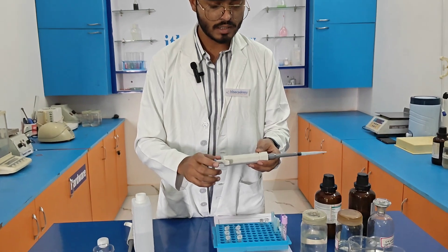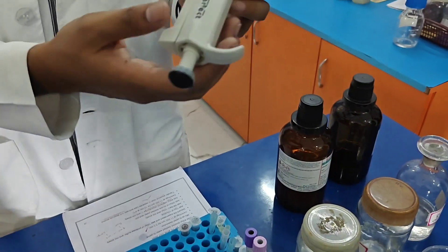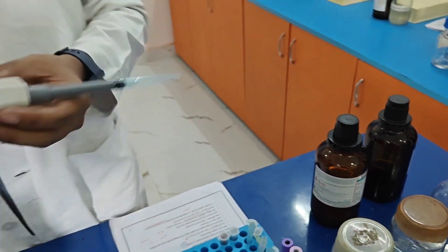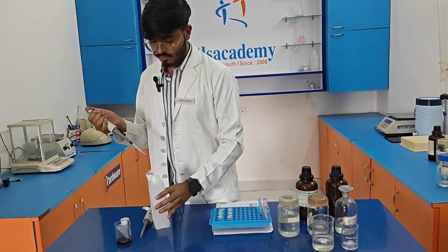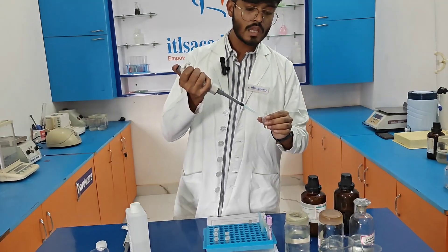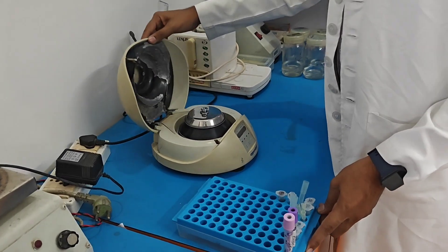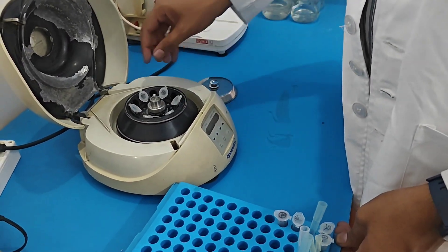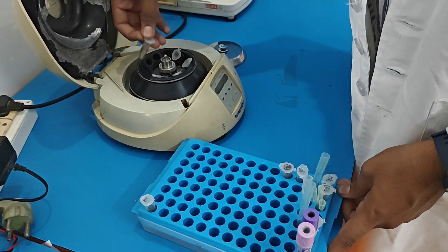As you can see, I have already set 1 ml in the micropipette. After adding absolute alcohol to each eppendorf, we need to incubate it for 30 minutes at minus 20 degrees Celsius. After incubation, we centrifuge the eppendorf at 12,000 rpm for 10 minutes.